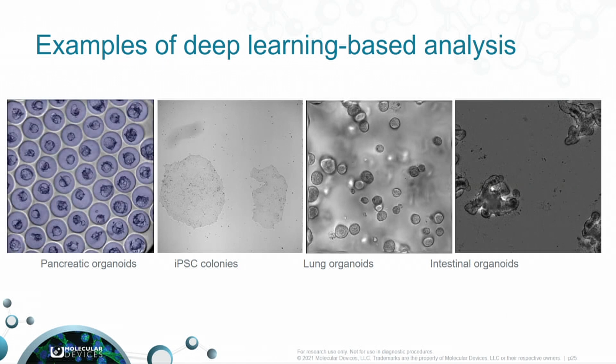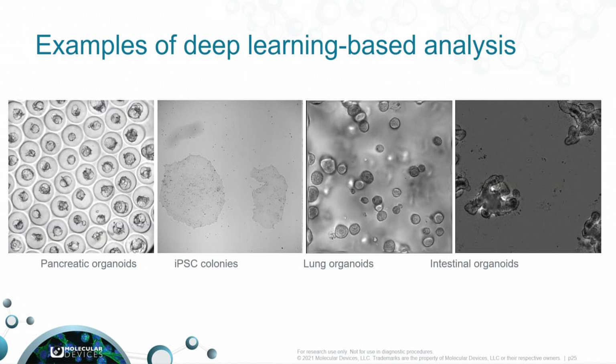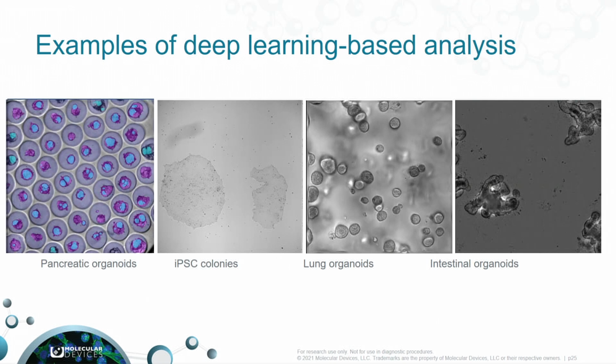So first we can get a model. We can use a model to identify all the microcavities, and that was done by Robert, who's sitting out there in the front. And then we can also identify individual organoids. If you look at these organoids, you would see that they've got some clear lumen or cystic areas, and we wondered if that was an interesting thing to track as well. So Robert created another model that would identify these little cystic or lumen structures. And we did find that those organoids that were treated with toxic compounds eventually had fewer of these cystic structures. So it was actually a good readout and a good thing to take note of in the experiment.